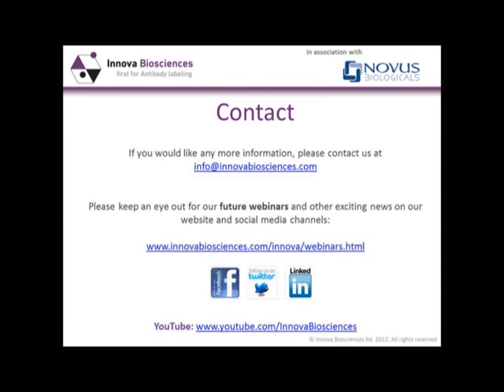Okay, thanks, Andy. We have a question relating to whether or how flow cytometry can be used for measuring apoptosis. There are a number of ways for measuring apoptosis, and if you are interested in apoptosis, what you really need to do is use a number of different techniques. The classic examples would be to use flow cytometry assessing Annexin V binding to assess the redistribution of phosphatidylserine onto the cell surface, which is associated with apoptosis. One can also use antibodies which recognize the active form of caspase 3, particularly within the cell, but it's always best to use a number of techniques.